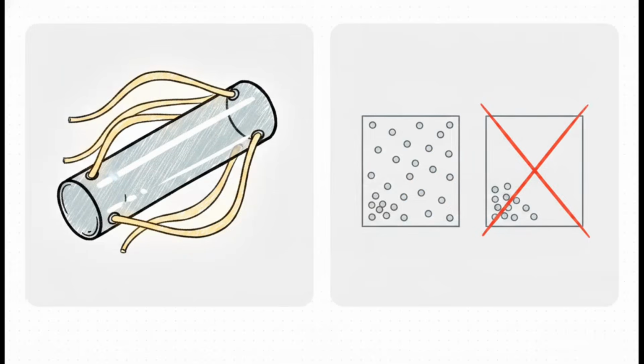Now, when we scale up and start building larger nanocomposites, which is basically mixing these nanofillers into a polymer matrix, FTIR does two critical things. First, it evaluates if there's proper chemical bonding between the nanofillers and the surrounding material. Second, it monitors dispersion. It tracks structural shifts in the spectral peaks to tell us if the nanoparticles are evenly dispersed throughout the composite, rather than clumped up in one corner, which would totally ruin the material's structural integrity.